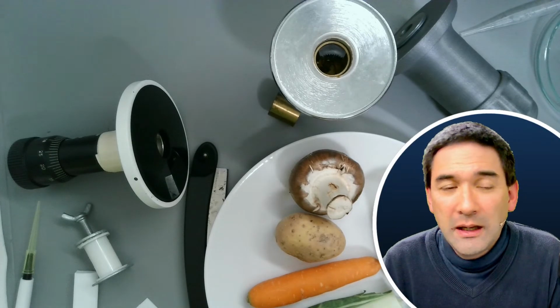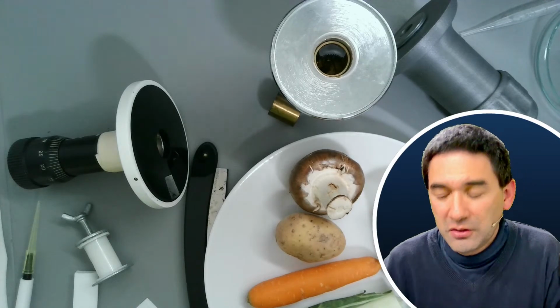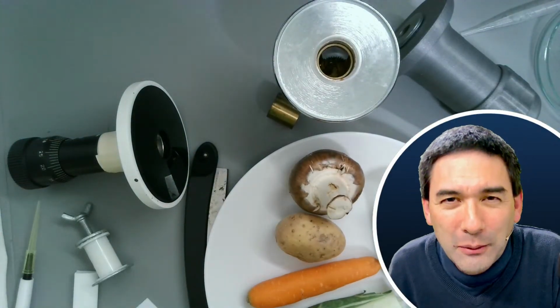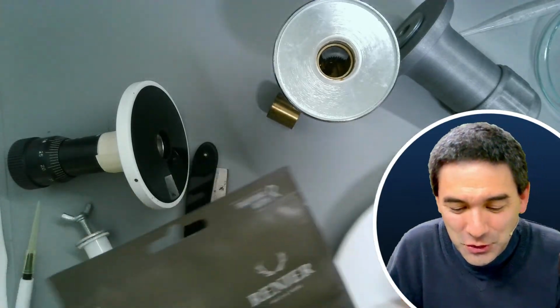So today I would like to simply show you a couple of things that I've got, especially those microtomes, and later on I would like to do the following. I would like to also put this under the microscope. I'm just going to show you what I got here.